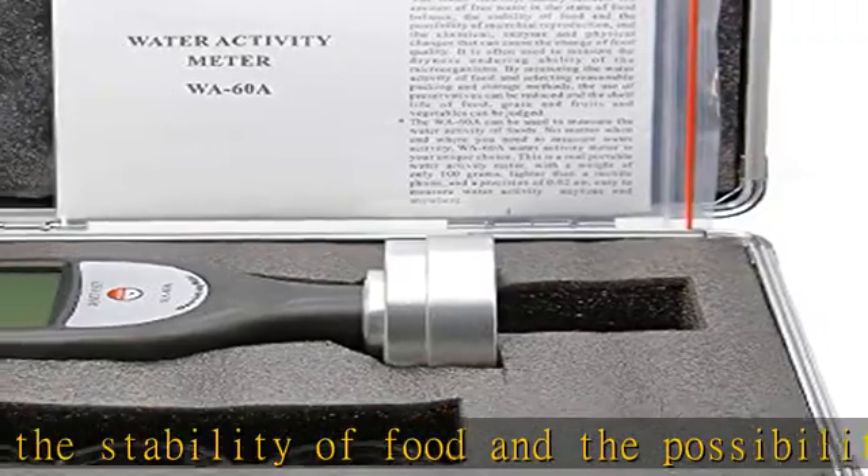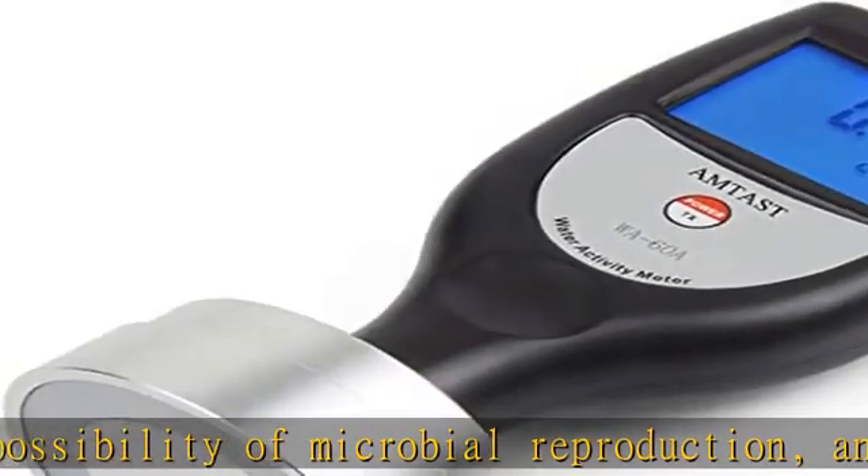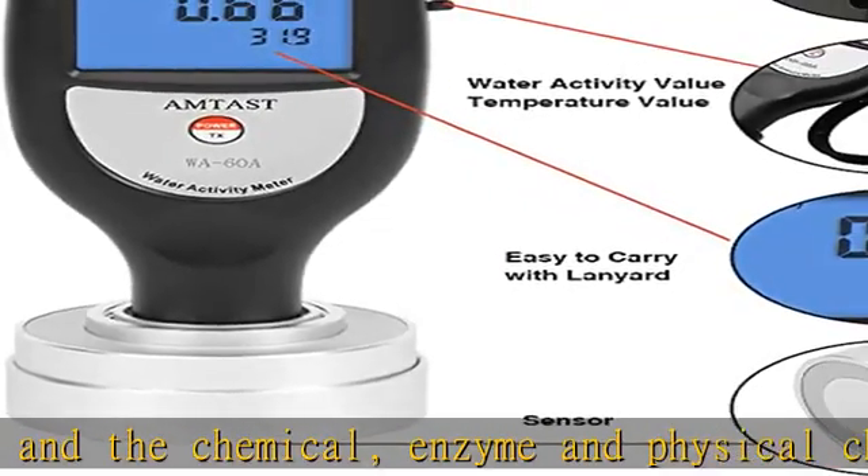By measuring the water activity of food and selecting reasonable packing and storage methods, the use of preservatives can be reduced and the shelf life of food, grain, and fruits and vegetables can be judged.